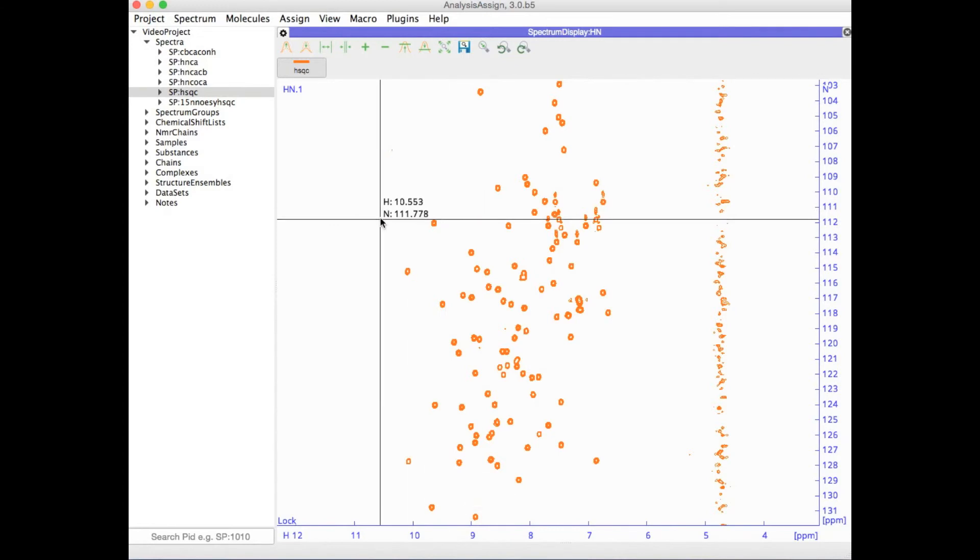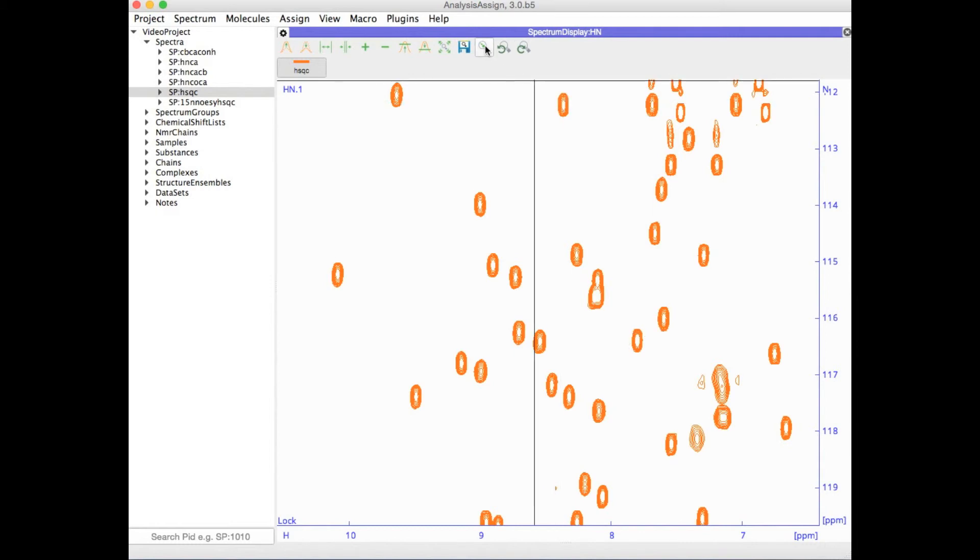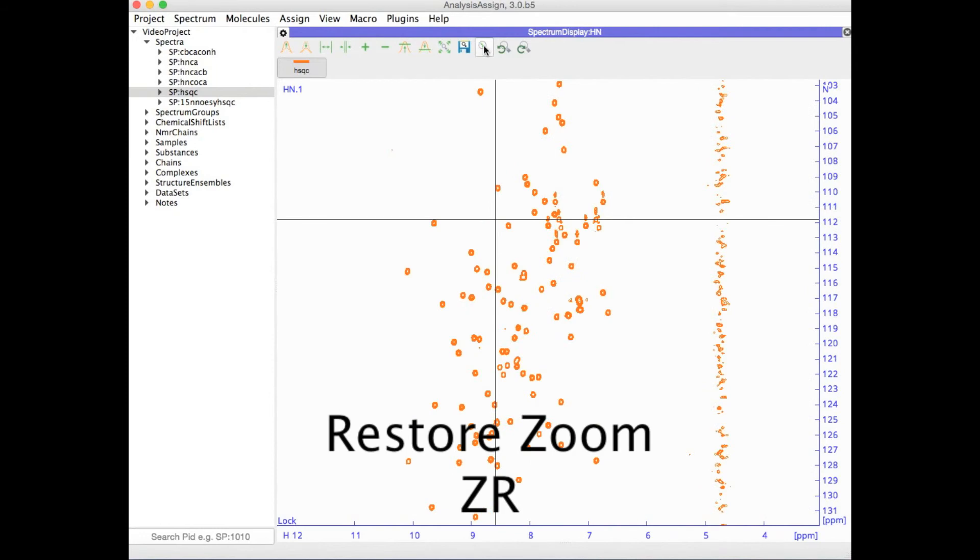You can then change your zoom level and if you want to go back to the stored zoom level, simply go to restore zoom or type ZR.